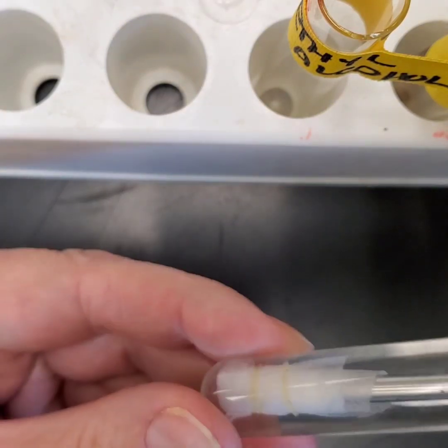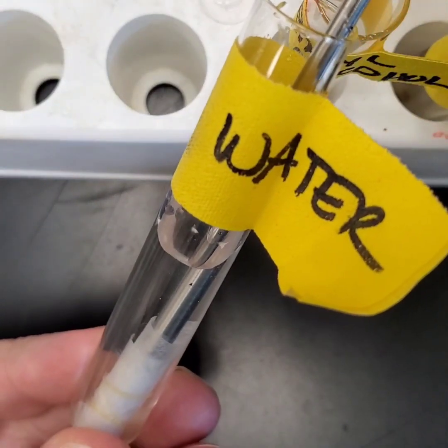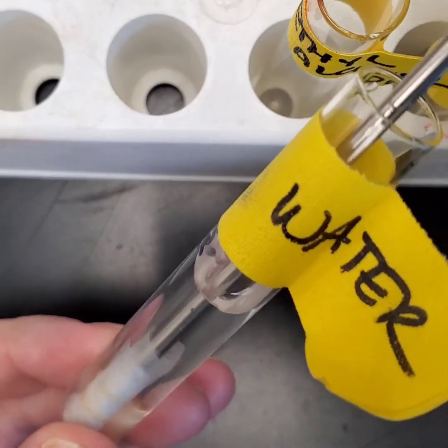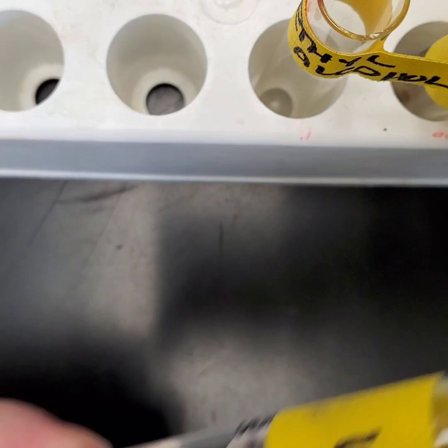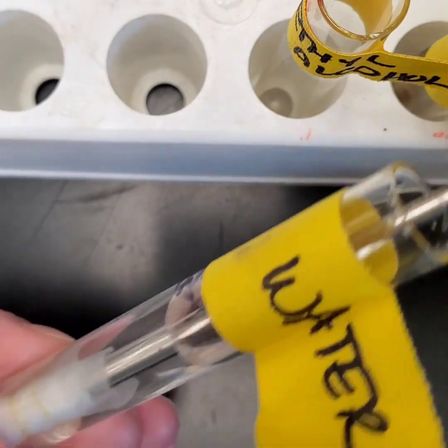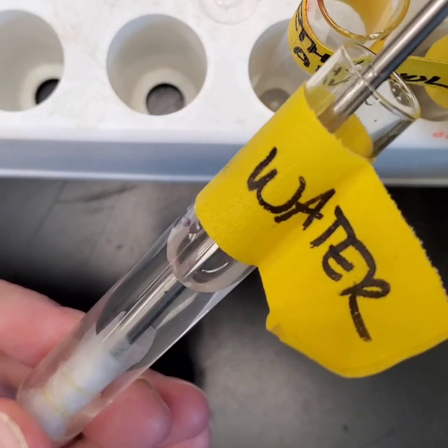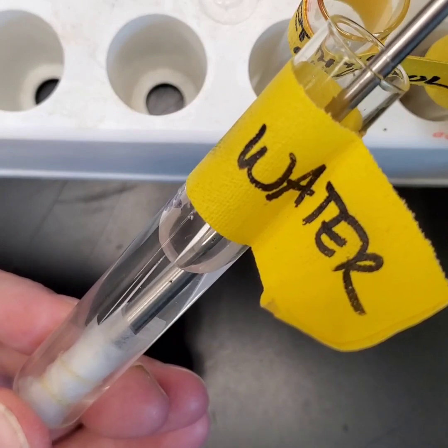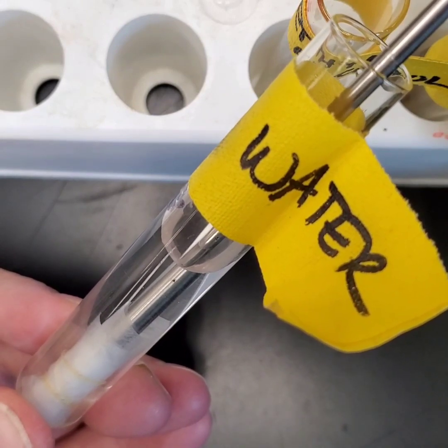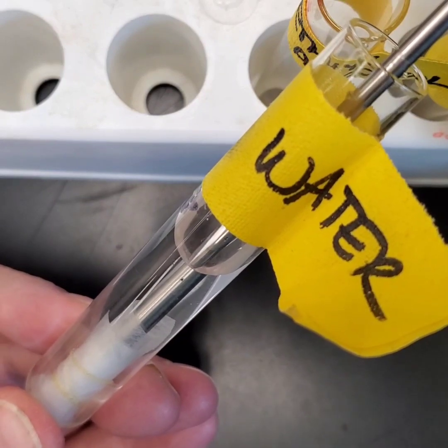All right, so we're at the procedure part now. I have a test tube filled with liquid, and this one is water. In the test tube, I have a thermometer that has filter paper on it. You can see the filter paper. Now we're going to pull the thermometer out of the liquid, and I'm going to rest it on the counter. When I rest it on the counter, I'm going to say go. The go is your zero point. That is your initial temperature of the water that's on the filter paper.